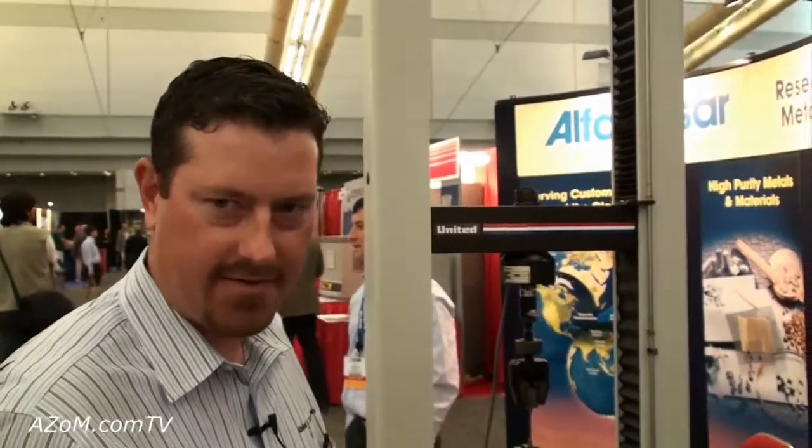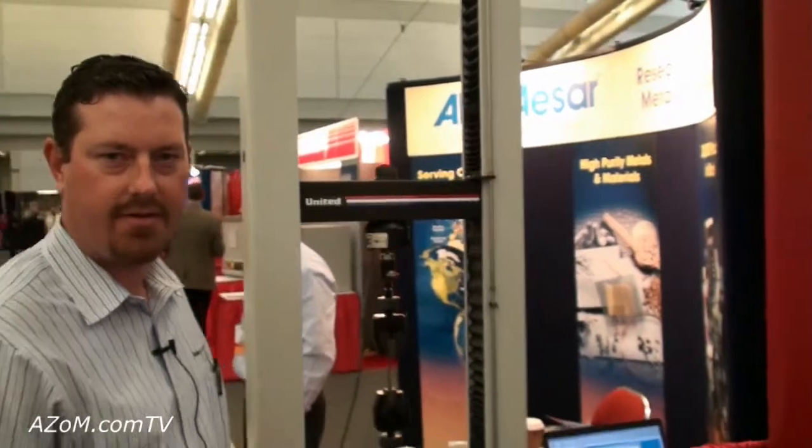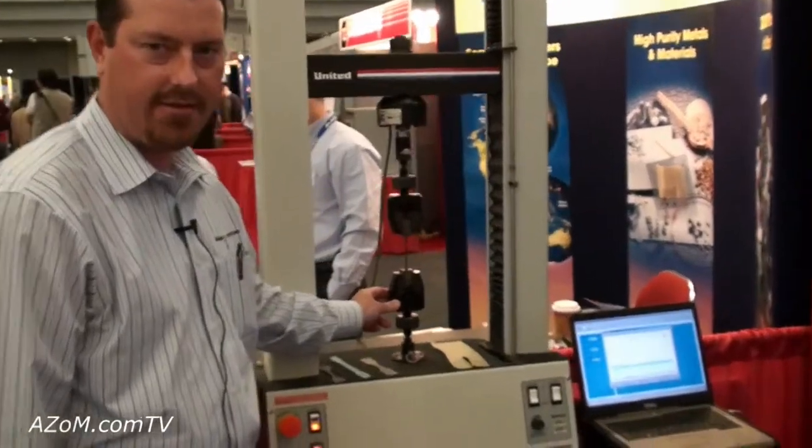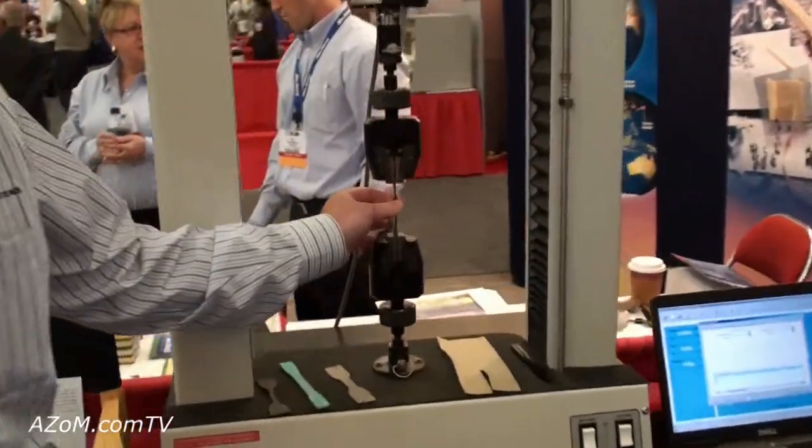Hi everybody. This is our SSTM 5kN USB hookup tensile machine. Right now we're using the Deluxe Action grips to test a D412 rubber sample.